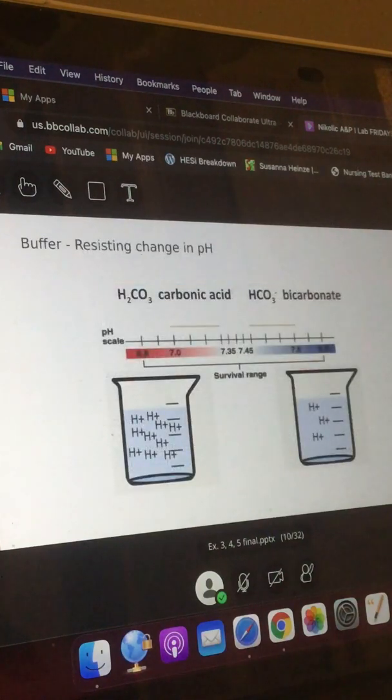That's it. Now we're going to do page 18. Although the prerequisite information is on page 17. In other words, what's a buffer exactly, right? And I talked about the buffer with the first slide before we got into the first experiment. Now, there are 3 experiments in this exercise. Again, we would do this in lab, so you can see the way I'm doing it. I'm just giving you the important pieces, and then we're going to look at what happens each step of the way.